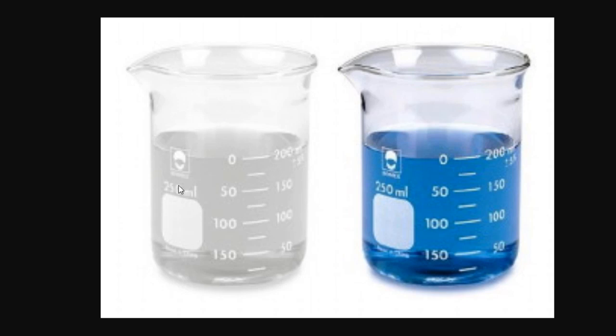So let's say I did ask you to get 250 mils. Well, then don't use this beaker. Use a 400 mil beaker, and then you've got lots of space to carry stuff. So that's all that's saying. Just make sure you're not being stingy. Grab the right size beaker, grab the right size test tube, whatever it is that you're doing for your lab.